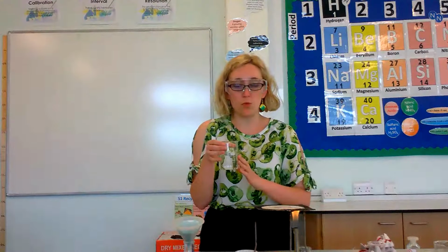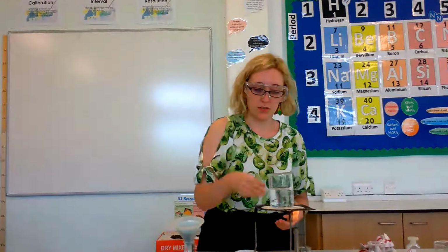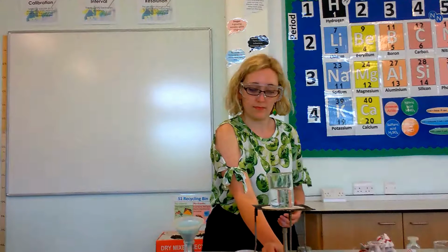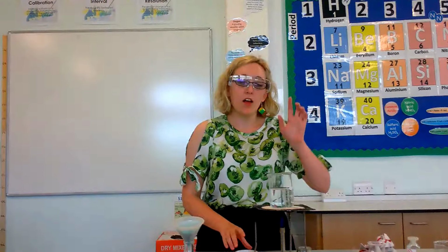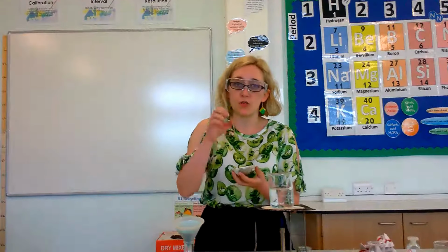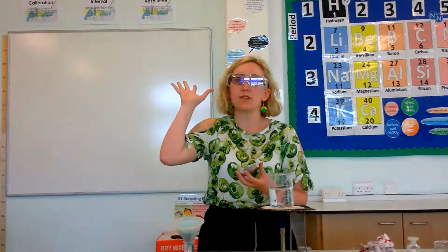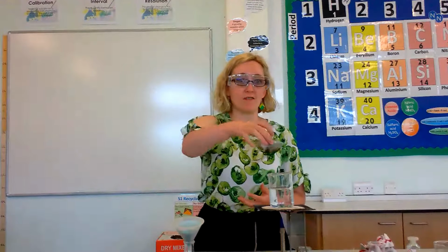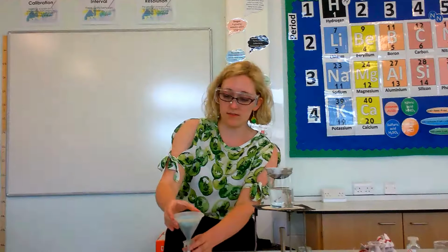Remember the beaker with the warm water? This is going to act like a water bath. We're going to pop that over the Bunsen burner, ready to heat up. You can turn it to blue flame now if you want. So we've got our blue flame, we've got our water heating up. The reason for the water bath is these can get very, very hot very quickly, and we don't want any of that stuff spitting at us, because if we've got copper sulfate and water spitting at our faces, or our friends' faces, that's not good, because we're going to get holes in our faces. So, there we go, evaporating dish goes in there.